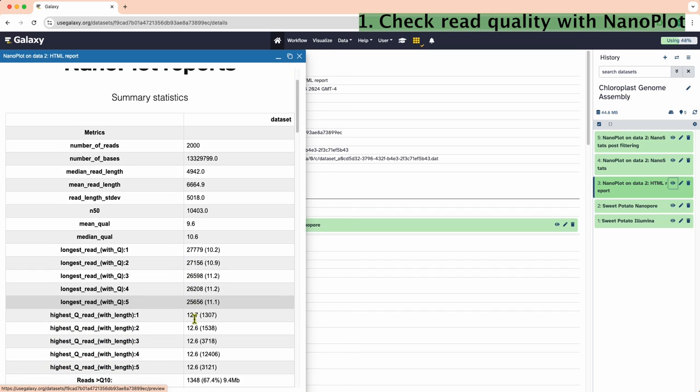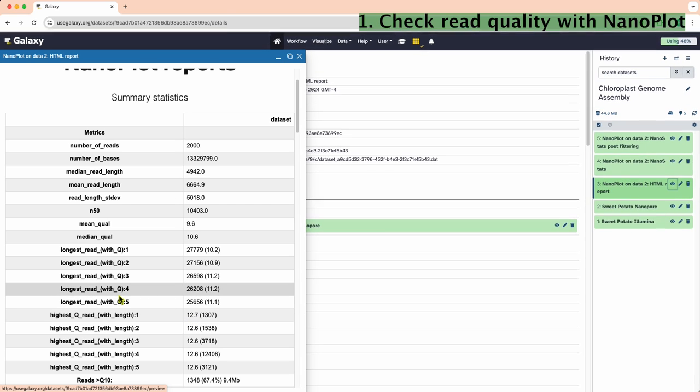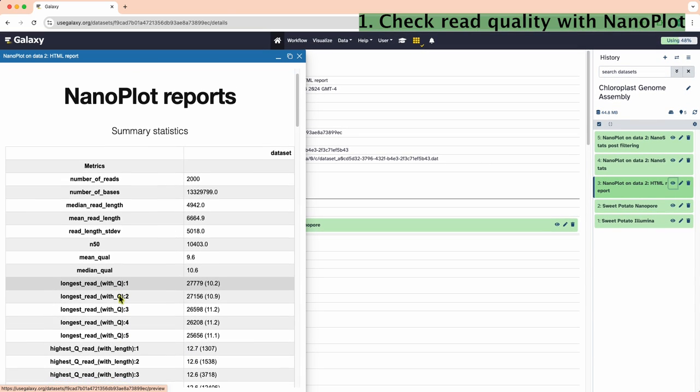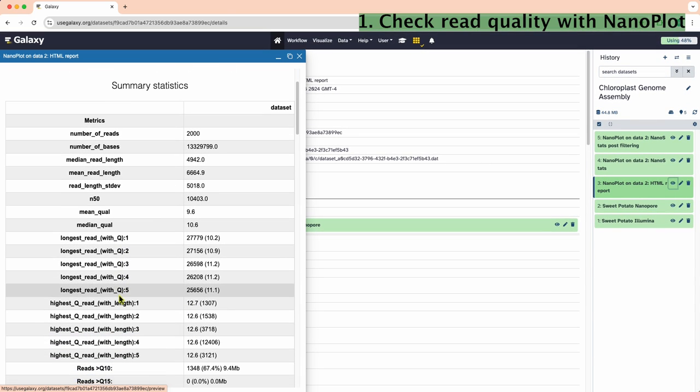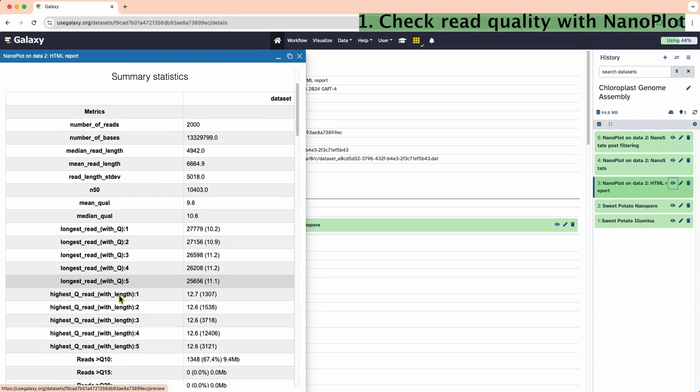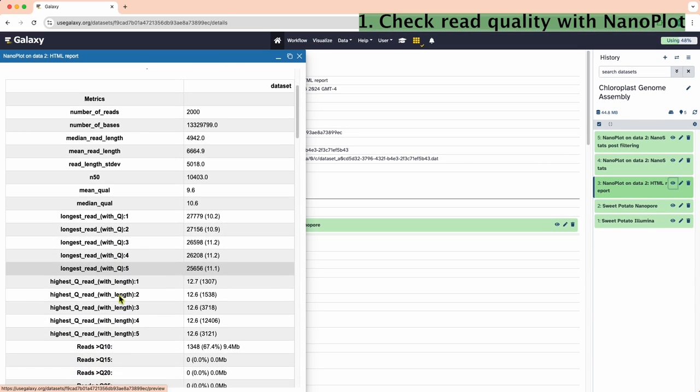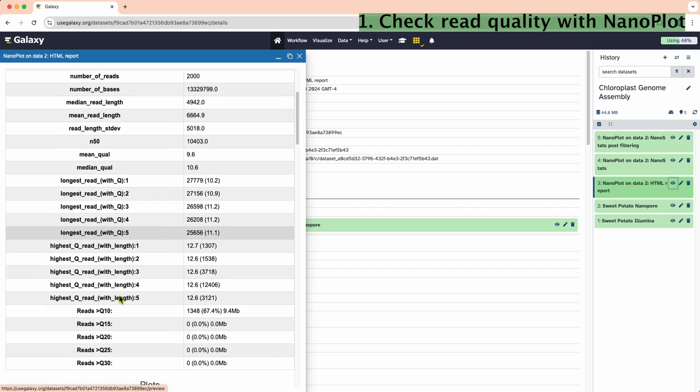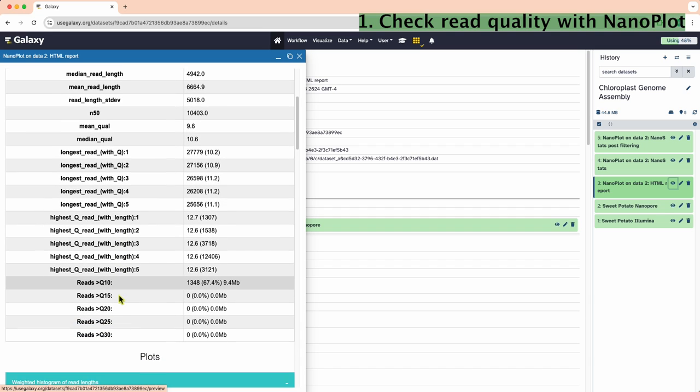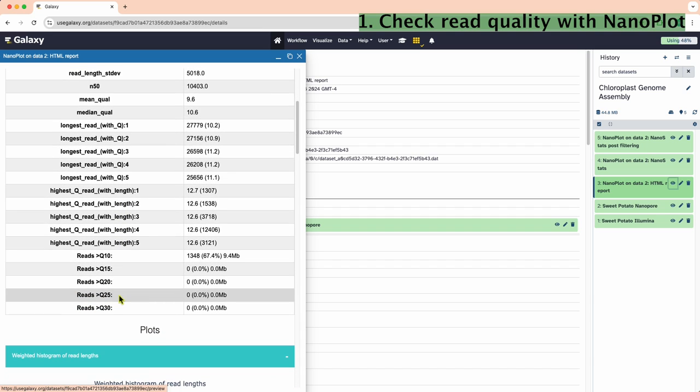Generally, we would be looking for information about sequencing depth, sequencing quality, and read length. Check out the histograms for read length.